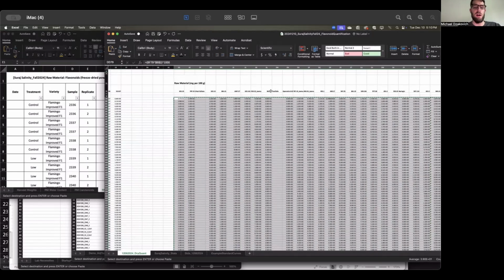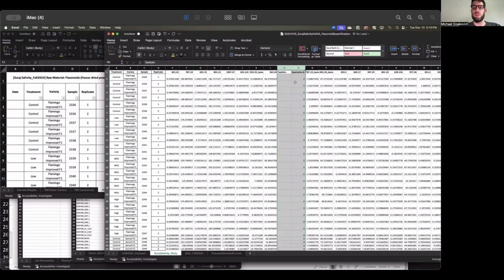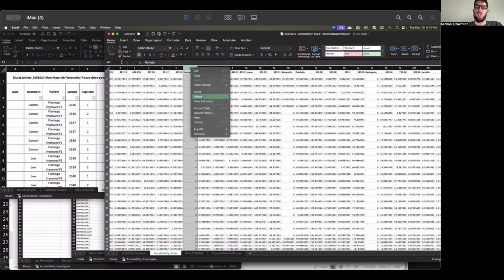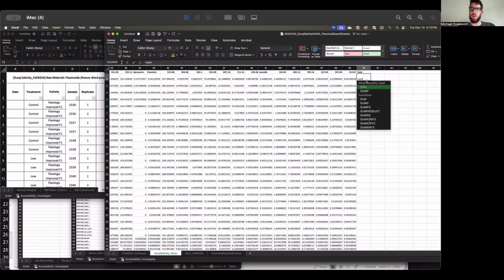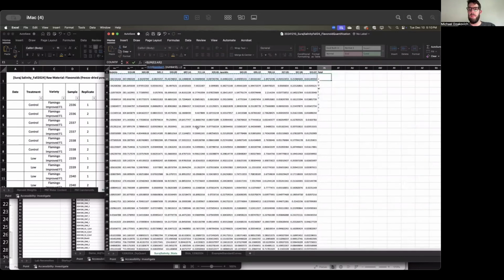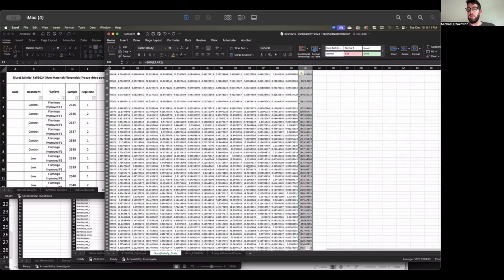And same with taxifolin. So at least for now, we can just go in here and delete ethyl gallate. We can delete, oh yeah, and then quercetin 3-glucoside. That's our external standard that isn't actually in our samples. Naringin, we can delete. Naringenin, we can delete. And I believe that's it. And then we could also do a total here. Just do a sum, and I'll just click that down. Great. Okay. So yeah, and by the way, these numbers are huge.